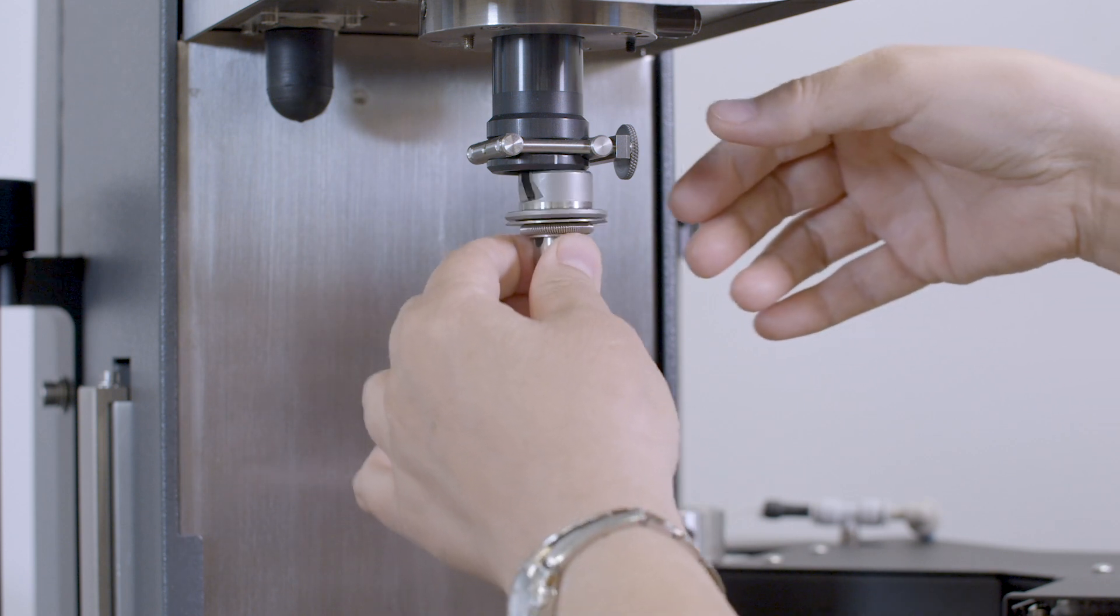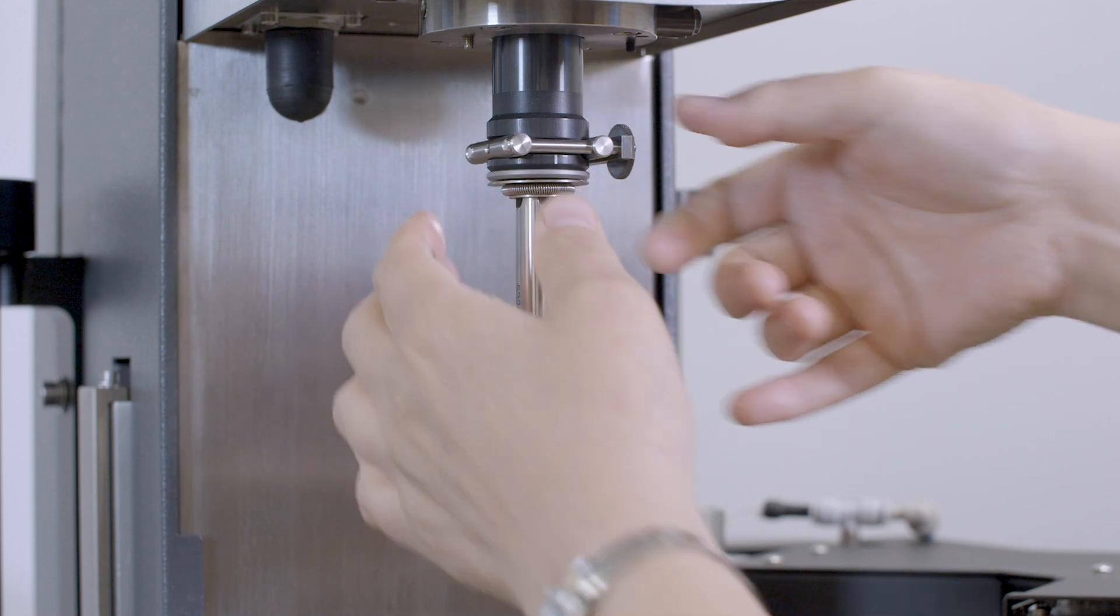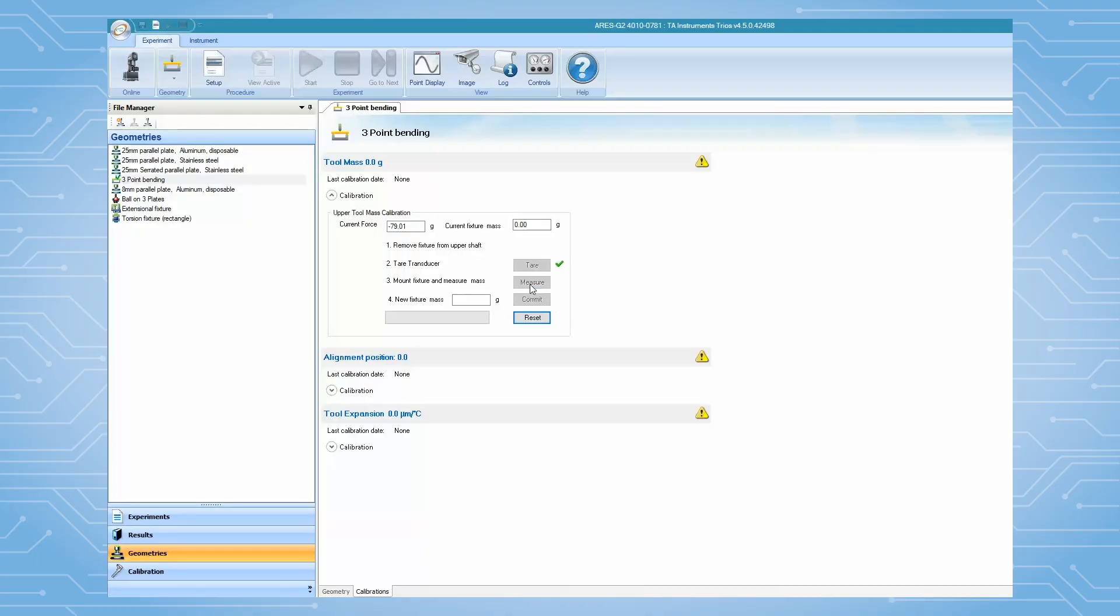Measure the mass of the upper tool, then click on Commit to complete the two mass calibration.